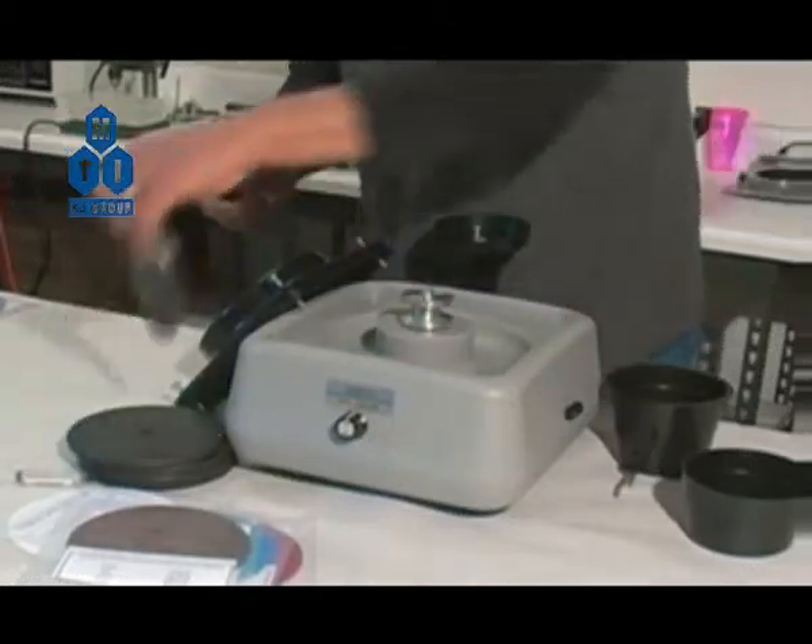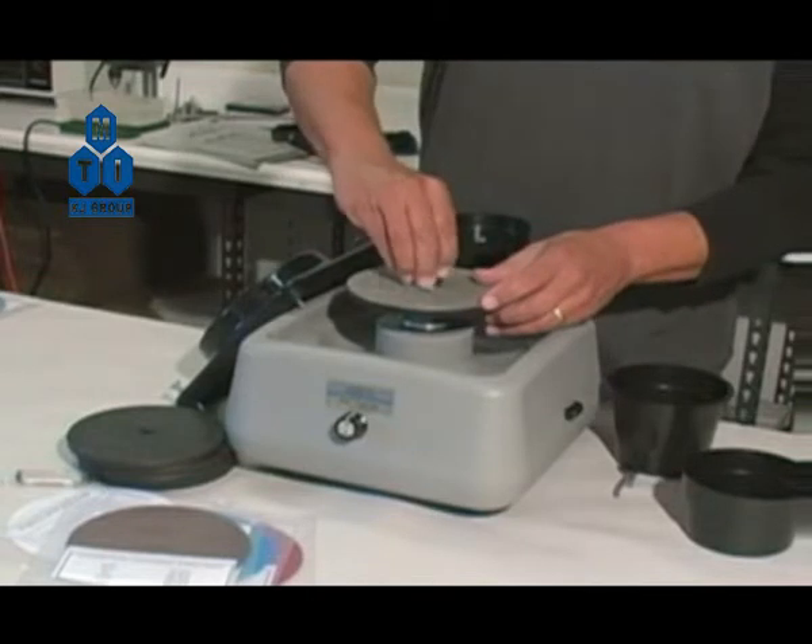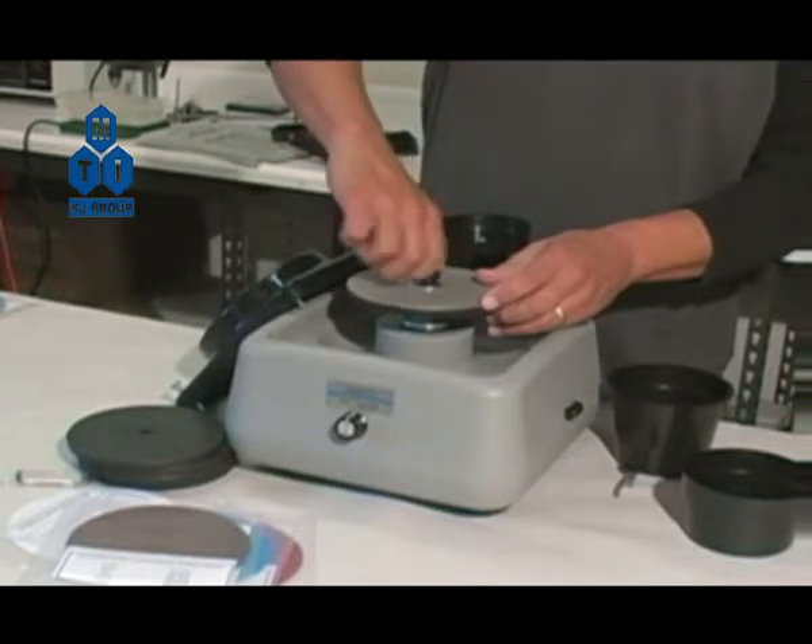Second, place the disc on the arbor, placing the washers and arbor screws back onto the arbor and snug down tightly.